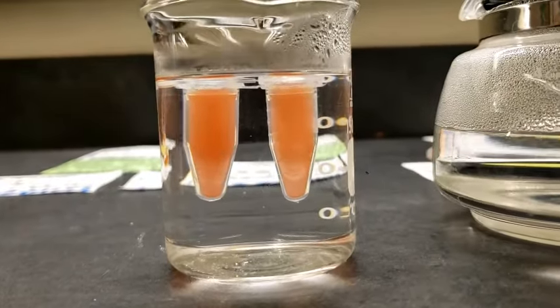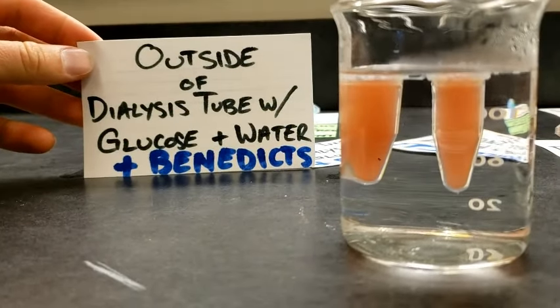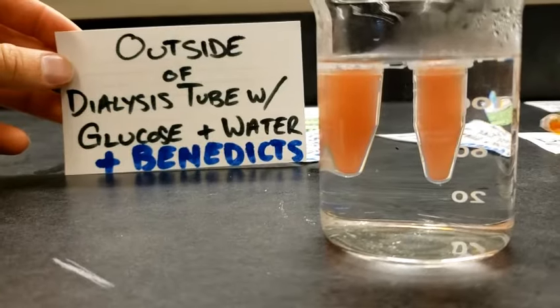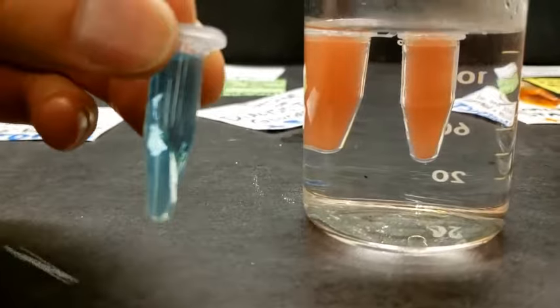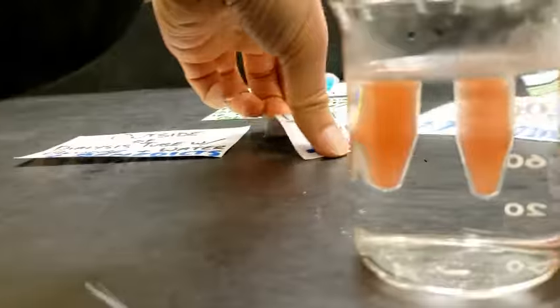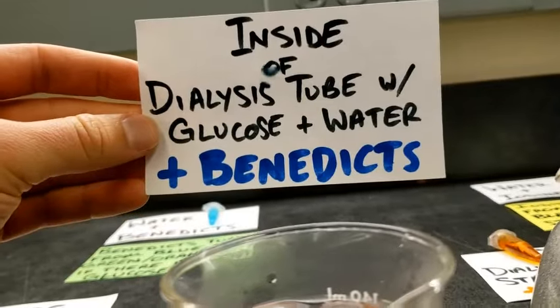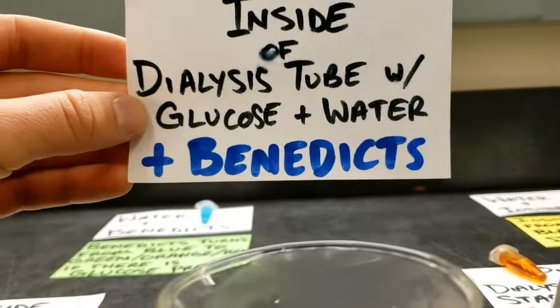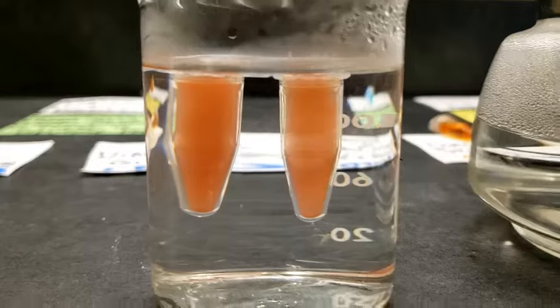Okay, it has been 5 minutes. The microcentrifuge tube that you see on the left is the solution from the outside of the dialysis tube that had the glucose and water. We added the Benedict's, and then in order to activate the Benedict's solution, we put it into this hot water, and it has definitely changed color. Remember, this is what it looked like when it was just the regular water and the Benedict's solution. And then I took a sample of the solution from the inside of the dialysis tube, the one that I started with by putting glucose water into the inside of the dialysis tube. After adding and activating the Benedict's, this is what we see over here on the right, okay?